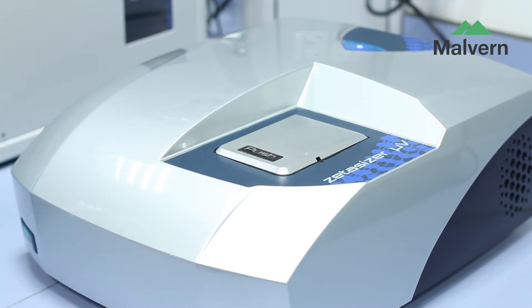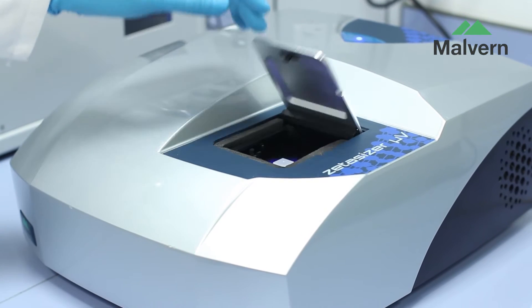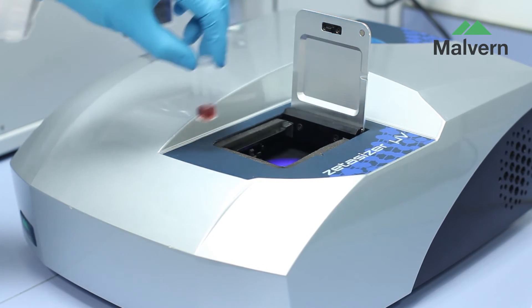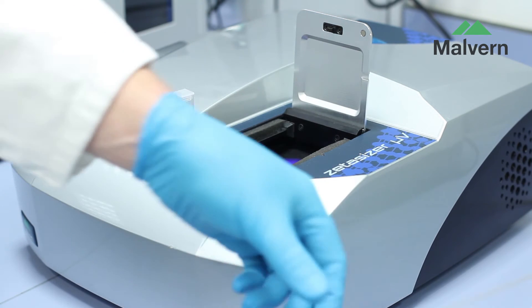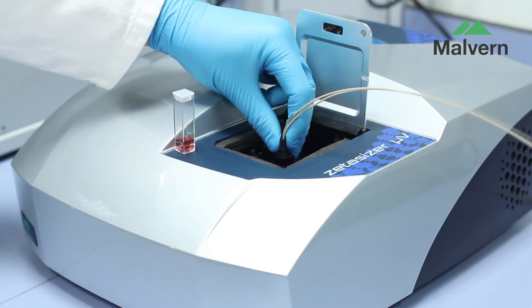Conversion from batch DLS to SEC detector mode could not be simpler or faster. Simply remove the batch cuvette and replace with the low-volume SEC flow cell and close the lid. The system is now ready to run.